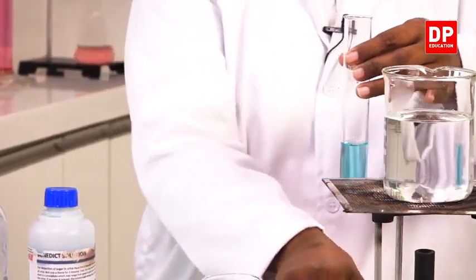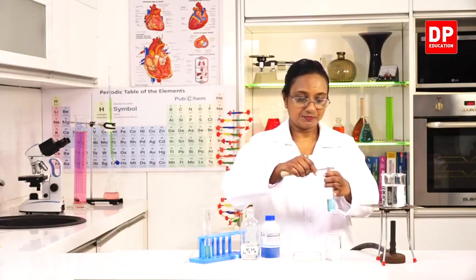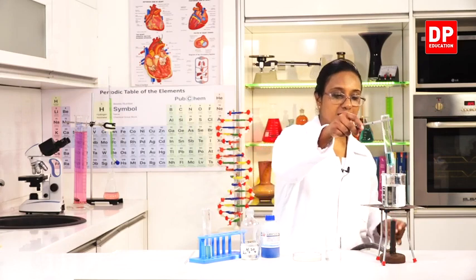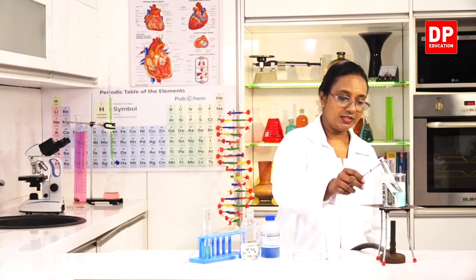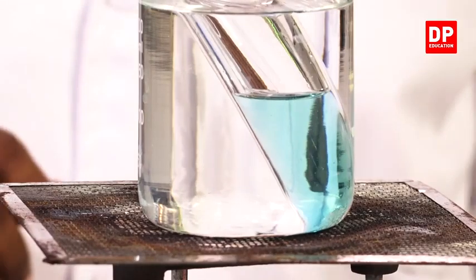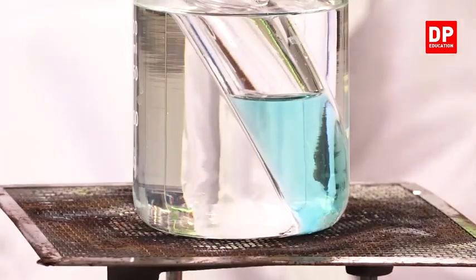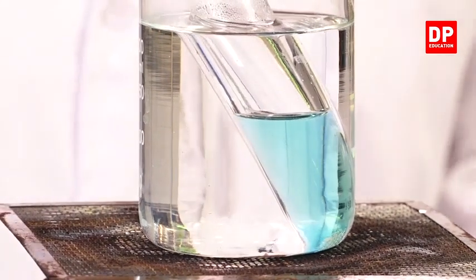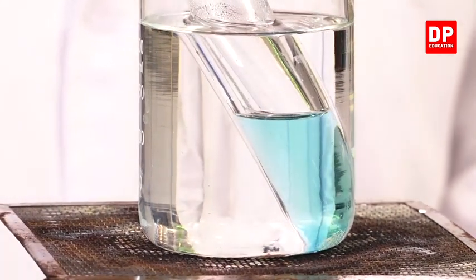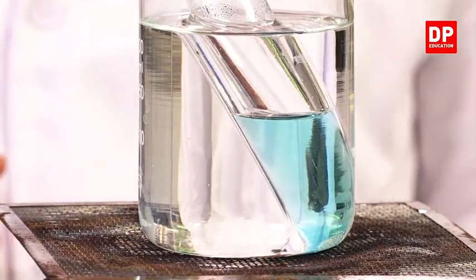Now we will heat the mixture using the water bath. Already I have prepared the water bath. We used it for the first part of the activity. Now observe closely. You will see the color change clearly. Try to recollect the color change, students.